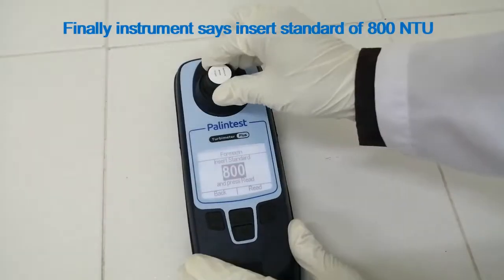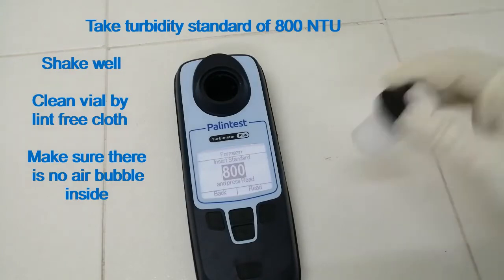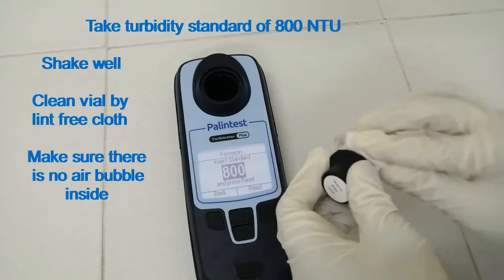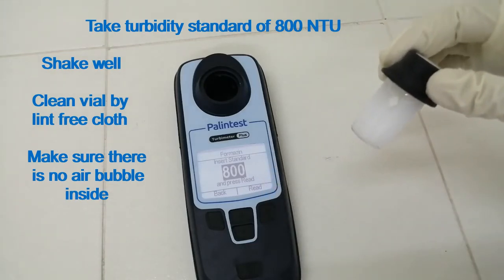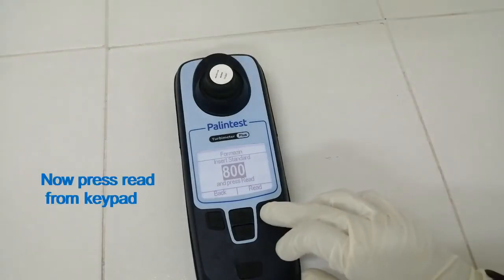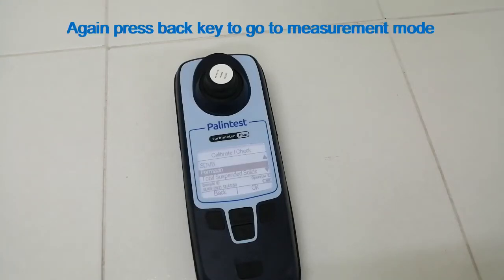Finally, the instrument says: insert standard of 800 NTU. Take the turbidity standard of ±800 NTU, shake well, and clean the vial with the lint-free cloth. Make sure there is no air bubble inside. Put it in the sample holder facing the white mark to the arrow, then press Read. The instrument takes 60 seconds to complete calibration and the screen displays successful. Then press back key twice to go to measurement mode.